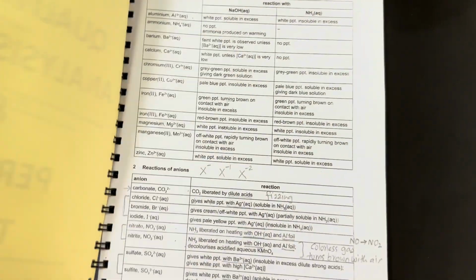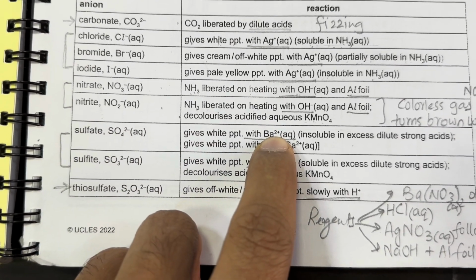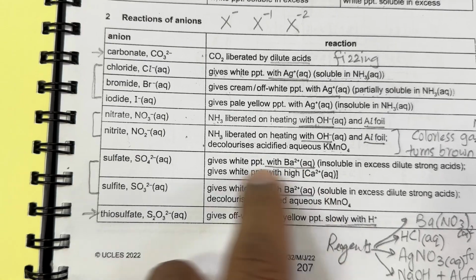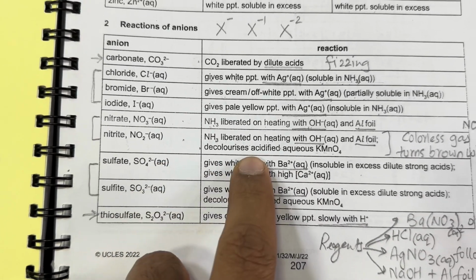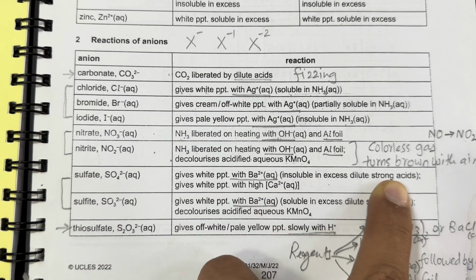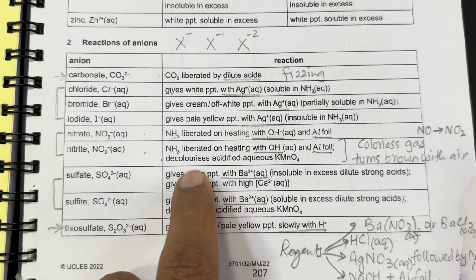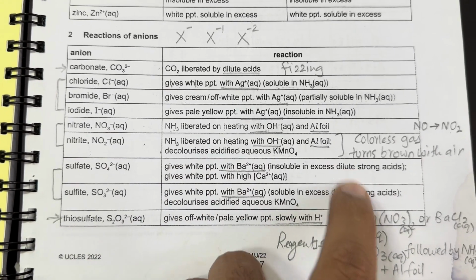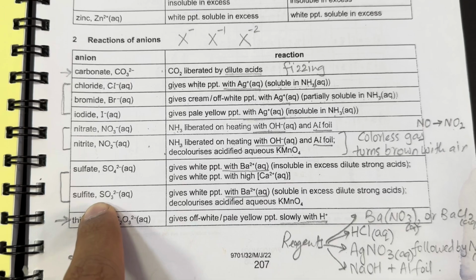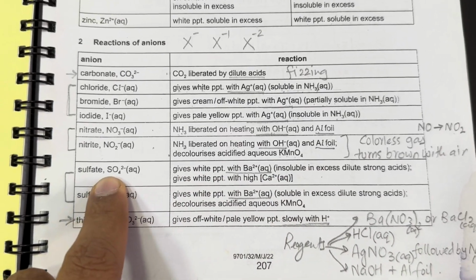So now let's look in the table. What we have done is we have added barium salt, and in these two sulfate or sulfite ions, barium 2+ salt will give you white precipitates. So we are confused with this, but let's read the further test. Insoluble in excess of a strong acid, soluble in excess of a strong acid. It means if the precipitates formed, we add a strong acid, the precipitates will either dissolve, means soluble, confirming sulfite, or if they are insoluble on addition of this strong acid, it confirms sulfate.